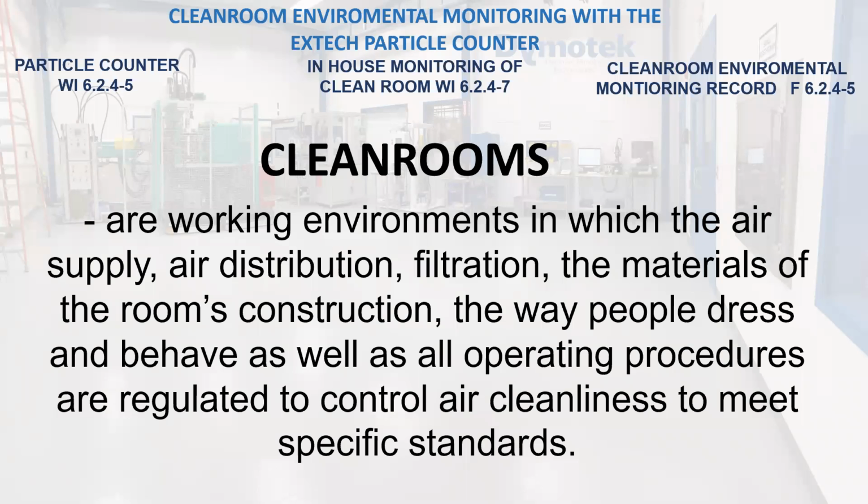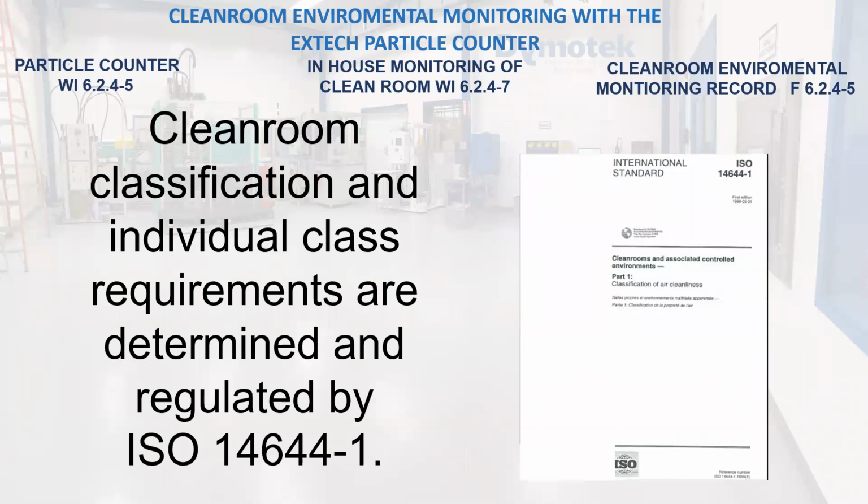Clean rooms are working environments in which the air supply, air distribution, filtration, the material of the room's construction, the way people dress and behave, as well as all operating procedures are regulated to control air cleanliness to meet specific standards. Clean room classification and individual class requirements are determined and regulated by ISO 14644-1, the international standard for clean rooms.